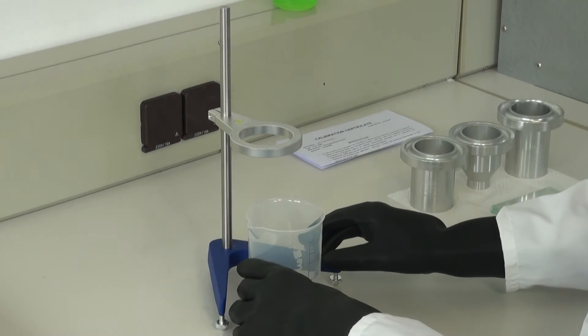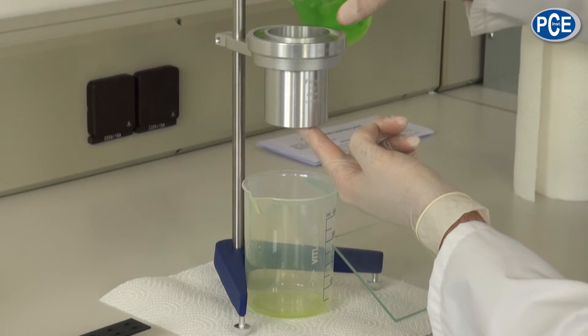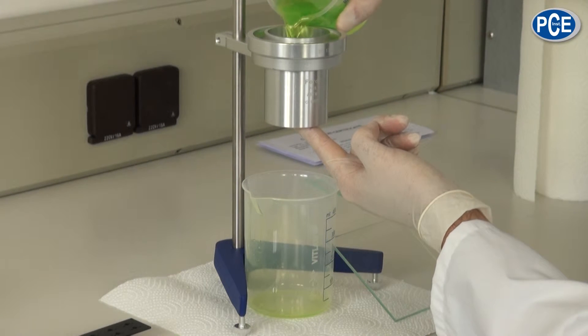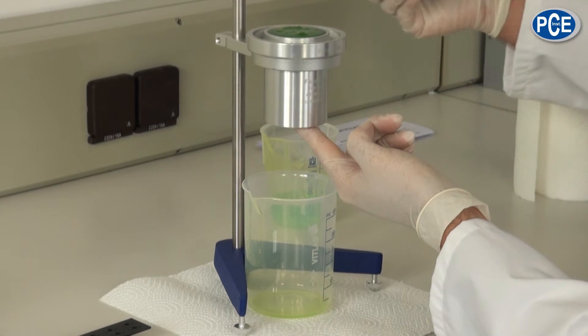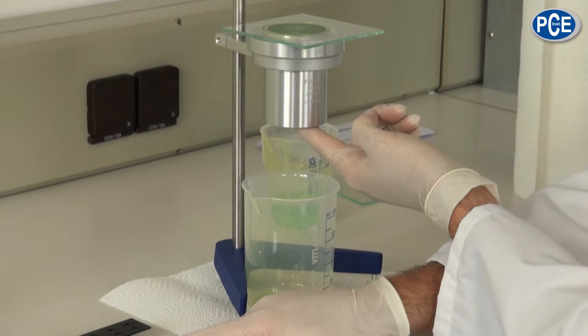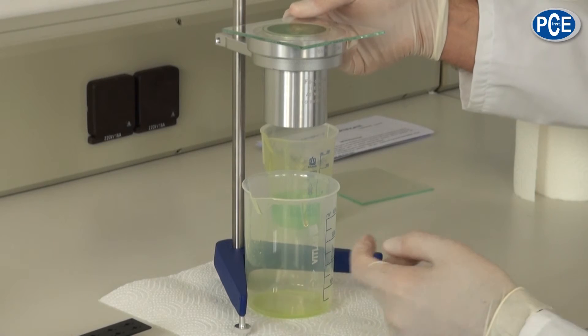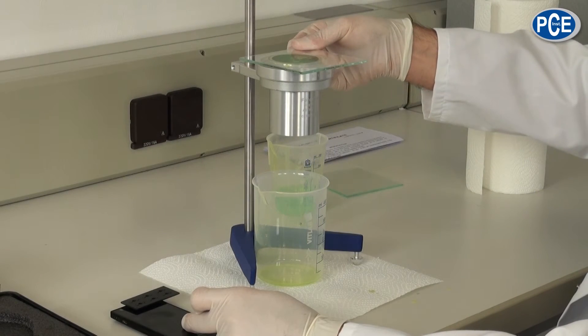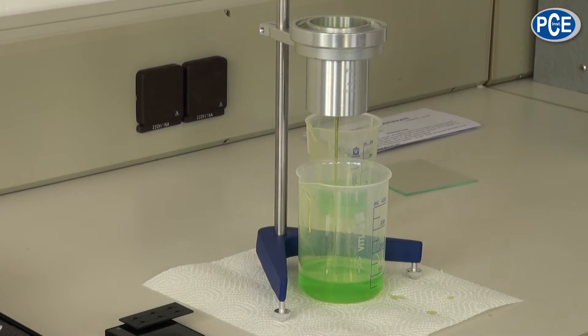To do a measurement, proceed as follows. We put the Flow Cup into the stand, put our finger onto the outlet nozzle, fill the probe into the cup, wipe off the overflowing probe, open the outlet nozzle by taking your finger away, take the glass plate off to start the measurement. Now the probe runs through and when the fluid stops flowing the time should be stopped.